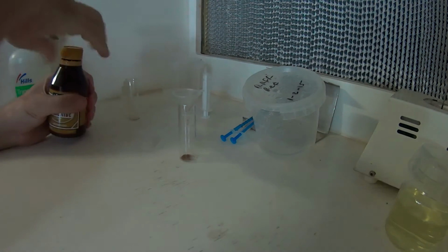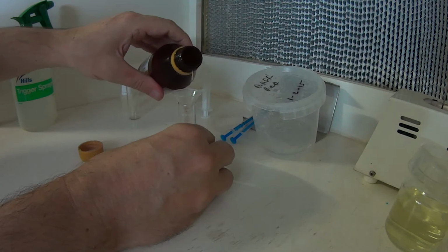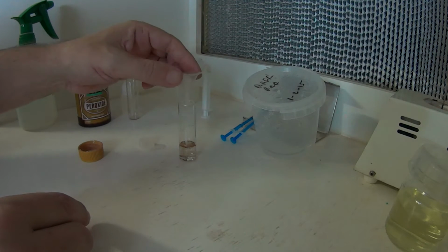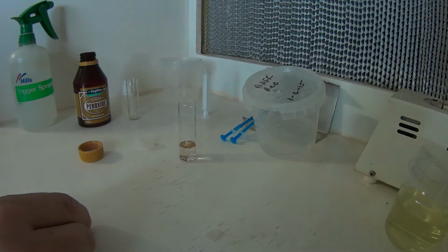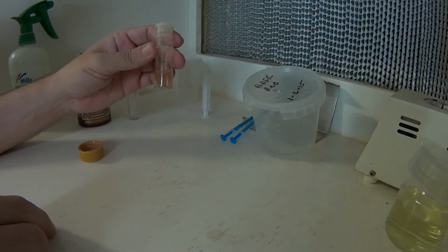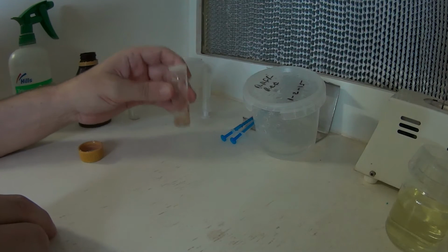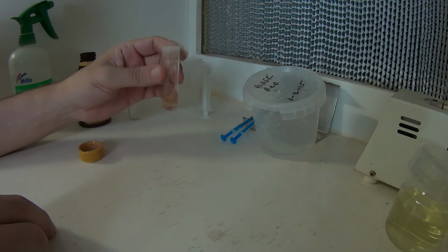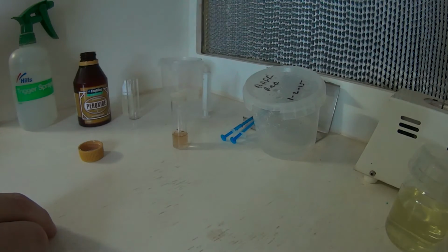So what we're going to do is pour a little bit of peroxide in here. Don't have to be exact, just not too much. Just try and wash a bit of that seed down from out of the little funnel as well. Got most of it. Alright, so we've got our orchid seed and our peroxide in there. I'm probably going to give it 5 to 10 minutes soaking in there to sterilise and get the hydrogen peroxide into the little pores on the seed. So we'll leave it for 5 minutes, 10 minutes, and then we'll come back to it.